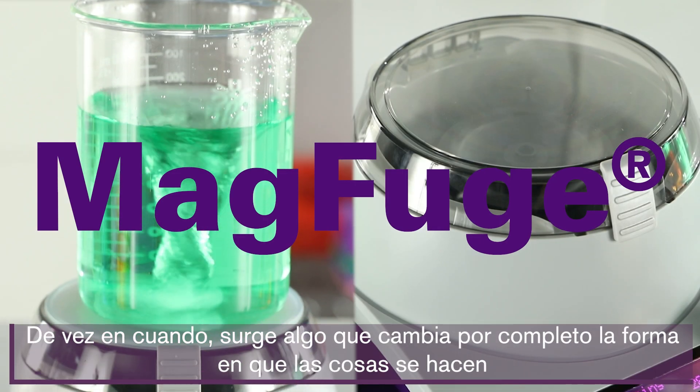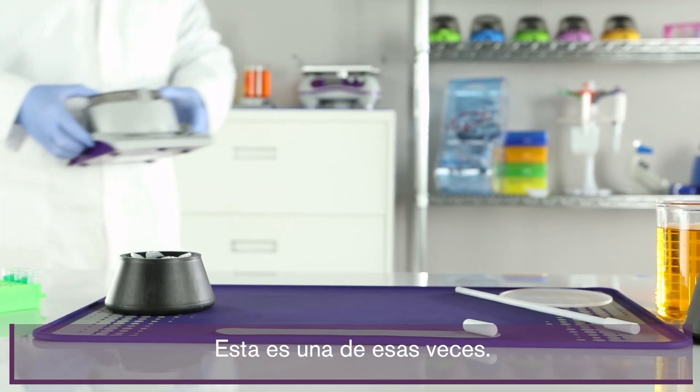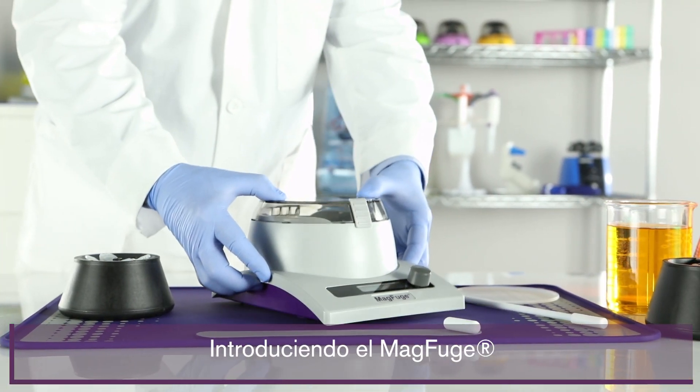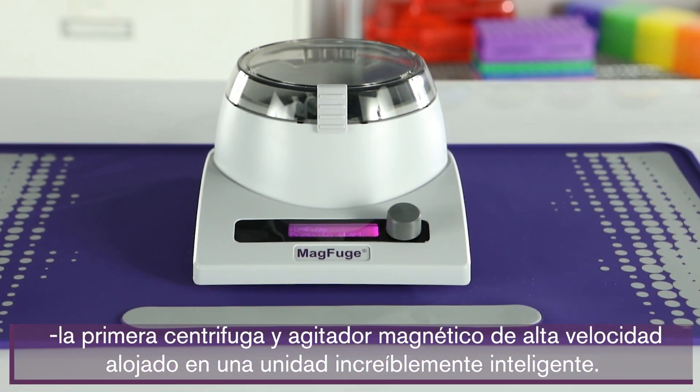Every once in a while something comes along that completely changes the way things get done. This is one of those times. Introducing the MagFuge — the first high-speed centrifuge and magnetic stirrer housed in one incredibly smart unit.